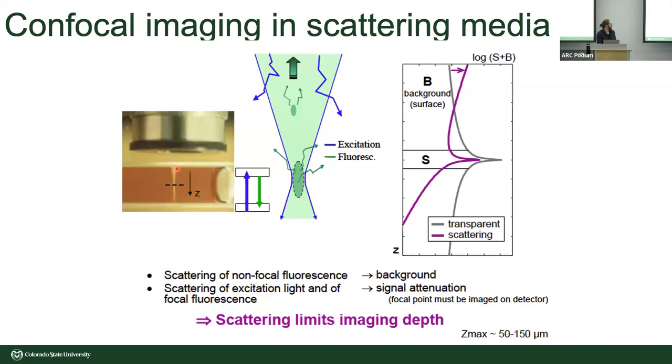In a confocal microscope, this fluorescent light in this region that's away from our focal spot would be rejected. It wouldn't make it to our detector. That means we're only measuring the fluorescent signal right here near the focal plane. We have this little picture here to show what might happen if we had a scattering sample. So instead, this whole hourglass shape here is our illumination. This little oval here is meant to indicate the region that we filter out with that confocal pinhole. That's the region we'd collect data from in a confocal microscope.